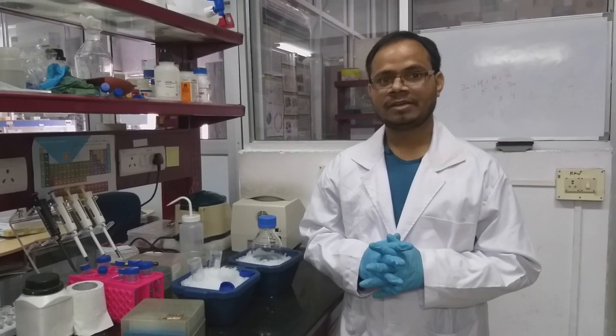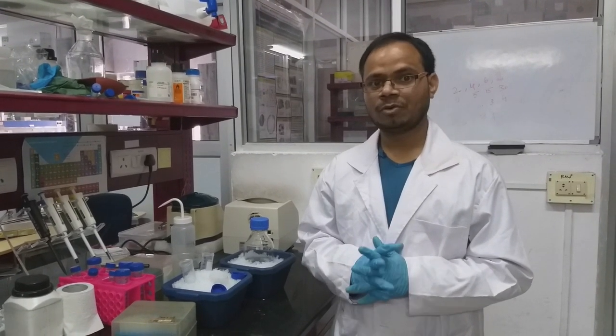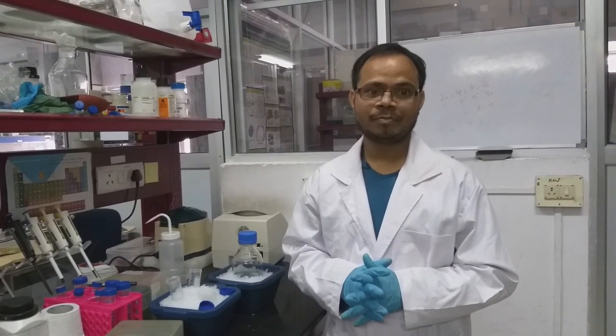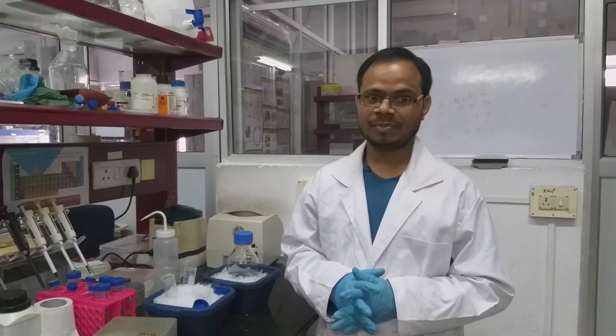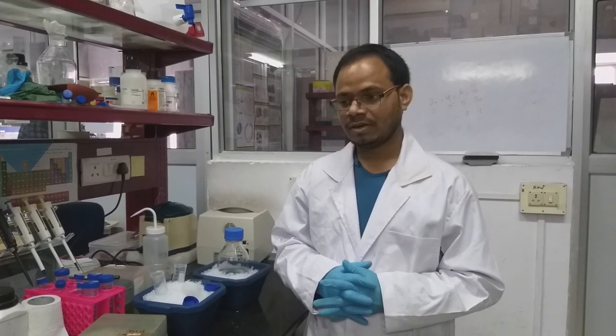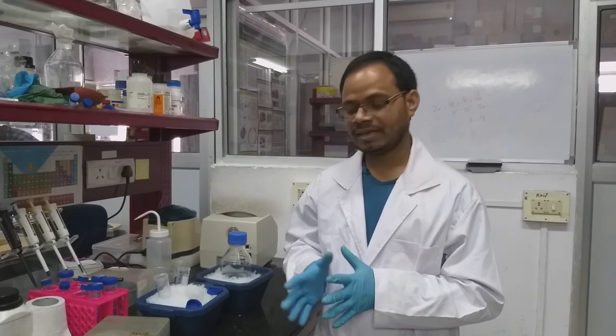Hi everyone, myself Suram Banesh, research scholar at Department of Biosciences and Bioengineering, IIT Guwahati. In this video, we will demonstrate how to sonicate the bacterial pellet, how to lyse the bacterial cells. We can lyse bacterial cells in multiple ways, like sonication, one of the methods. Apart from that, we can use a homogenizer. In this video, we will show you how to use a sonicator and lyse the cells.